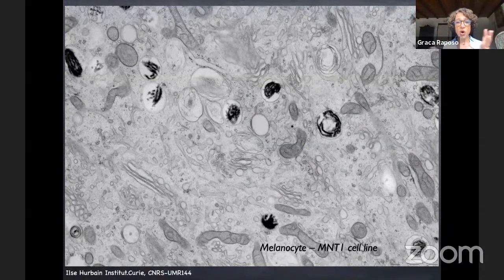They have these pigment organelles. I won't go into detail, but you can see different examples where you have the pigment melanin in dark, and in the center you can see organelles with small fibrillar structures. You can see one that is very close to the endoplasmic reticulum, and these fibrillar structures have been optimally fixed using high pressure freezing.